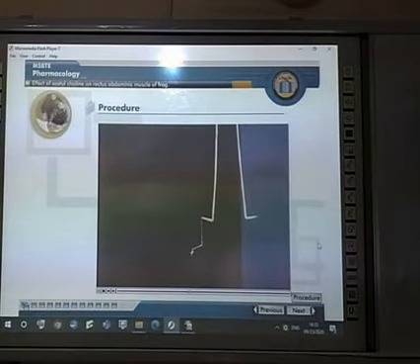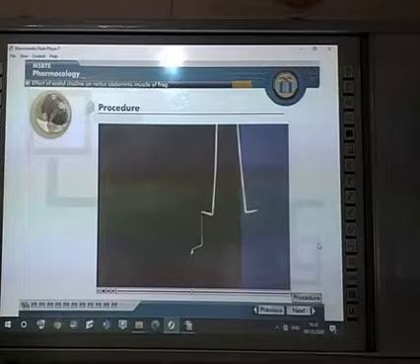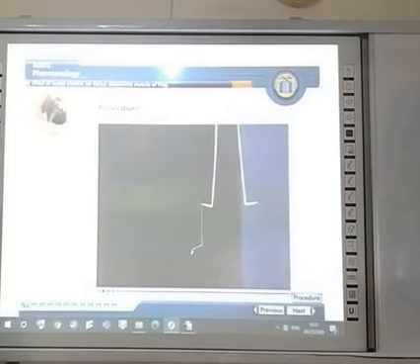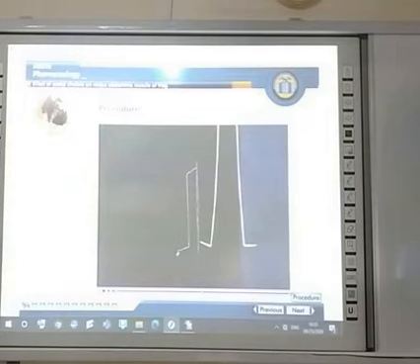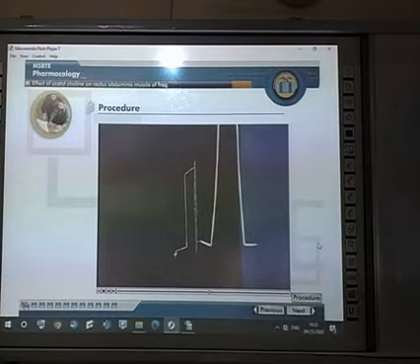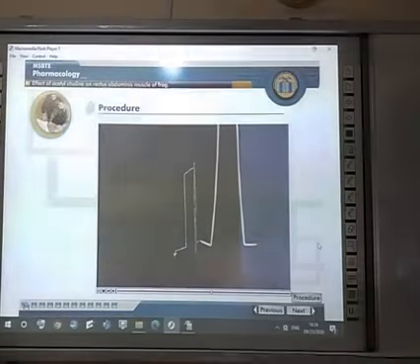You can see upward movement of the writing tip of the frontal writing lever on smoked paper. Stop the trial. Now relax the contracted muscle by rapidly washing with a fresh quantity of frog Ringer.